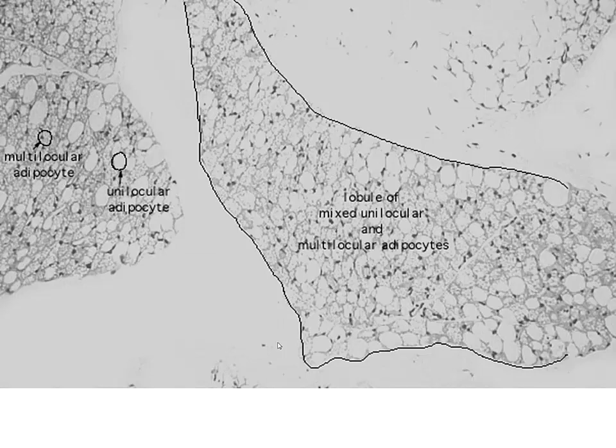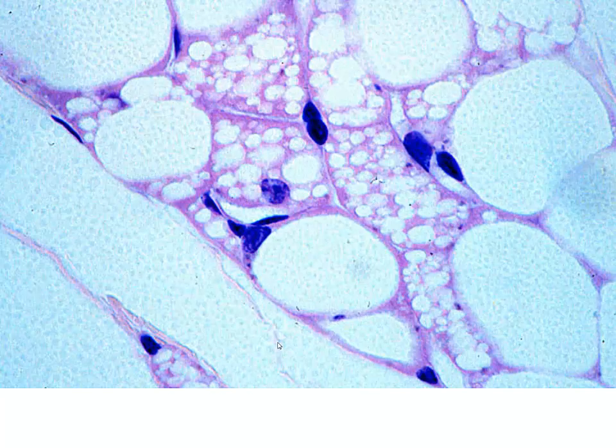So looking at higher magnification, we're looking for the droplets. And in this case, we have our nice signet ring appearance, one large droplet. And I know that you see the granular look. I think that's just an artifact of the preservation or the staining. This is one large lipid droplet. We can see the nucleus really squeezed to the periphery. This is unilocular adipose tissue.